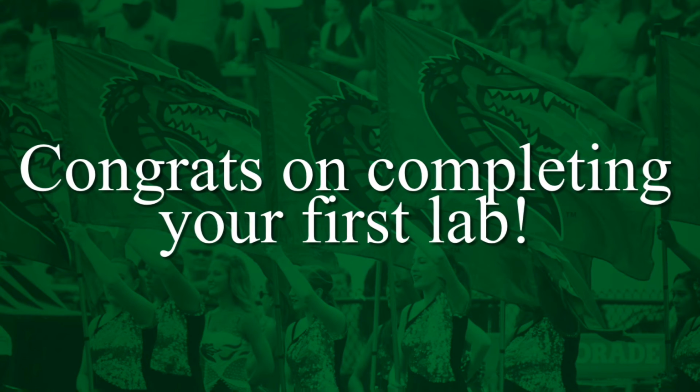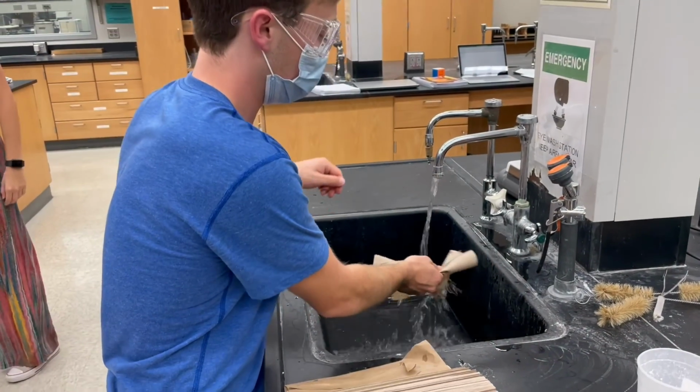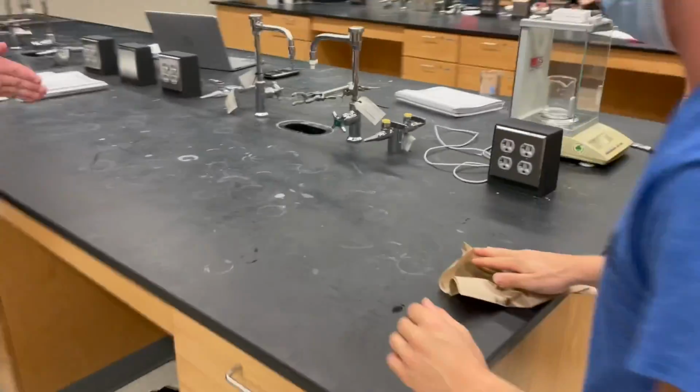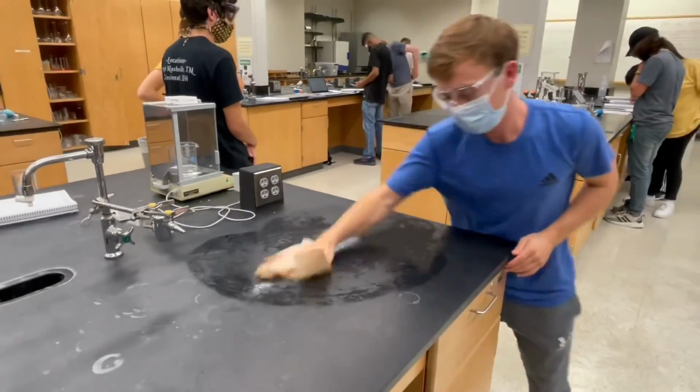You must clean up your lab space and dispose of the materials you used. For this experiment, you can simply wipe down your lab bench with a damp paper towel. After that, make sure to properly dispose of any excess reagents or solutions. For the substances used in today's dilution lab, it's okay to pour them down the sink.